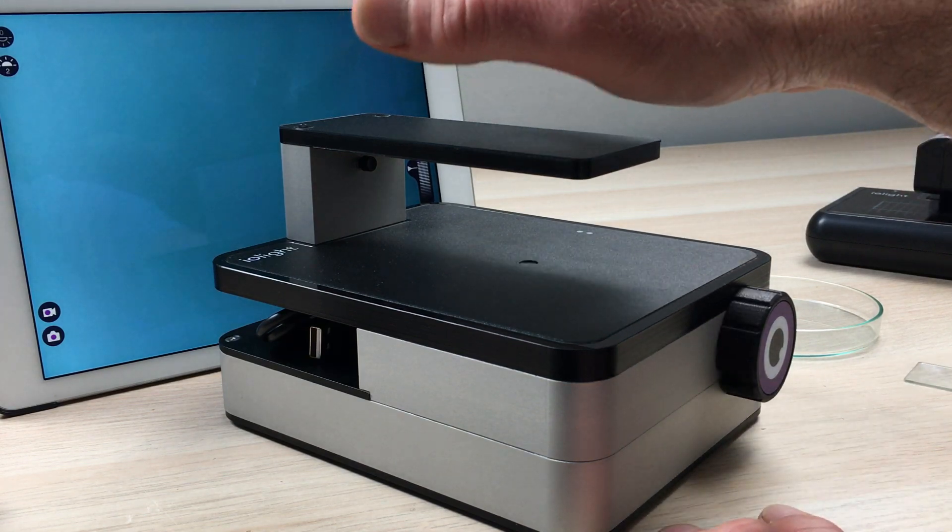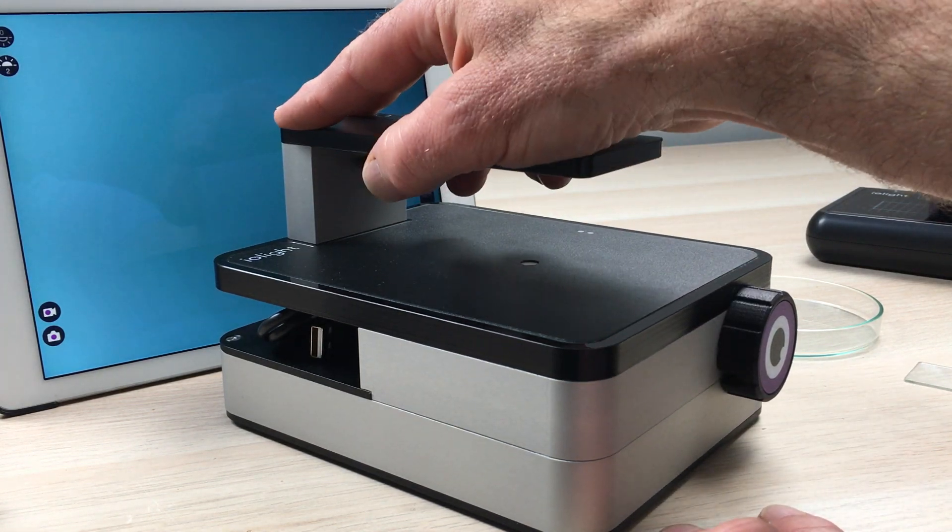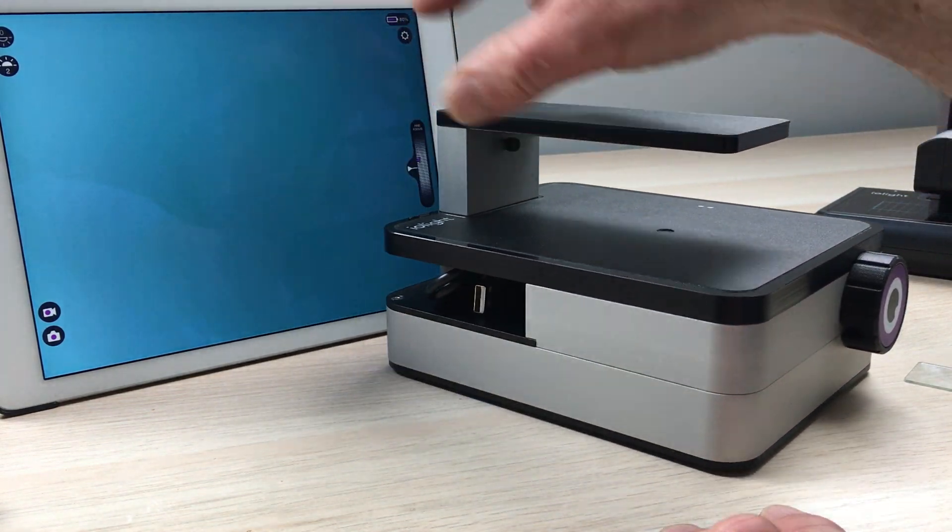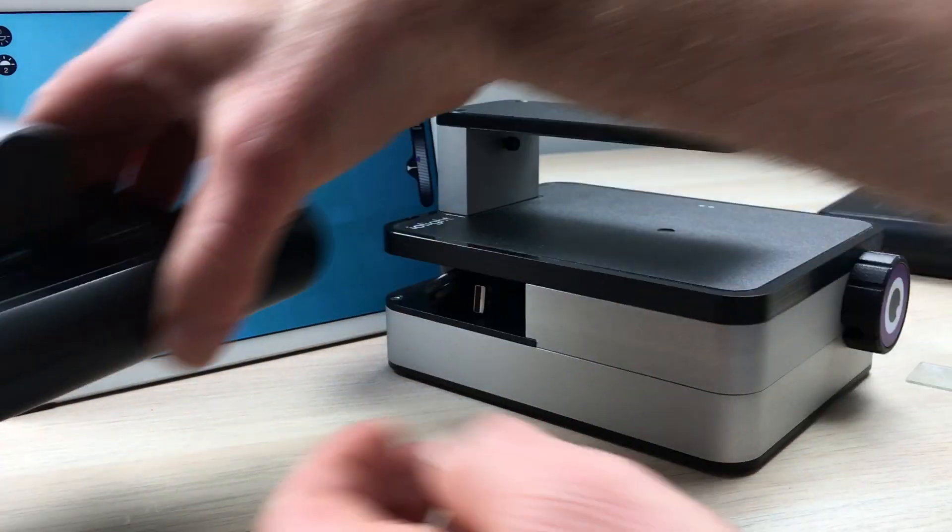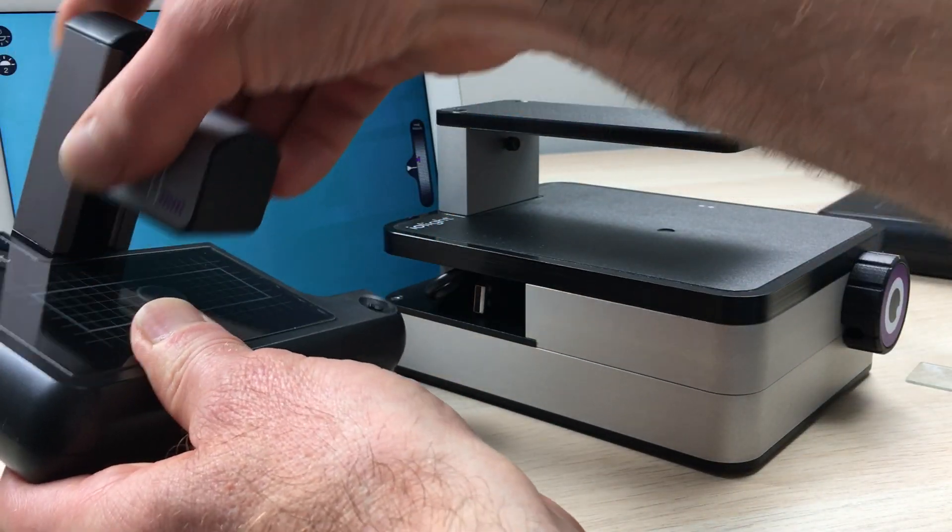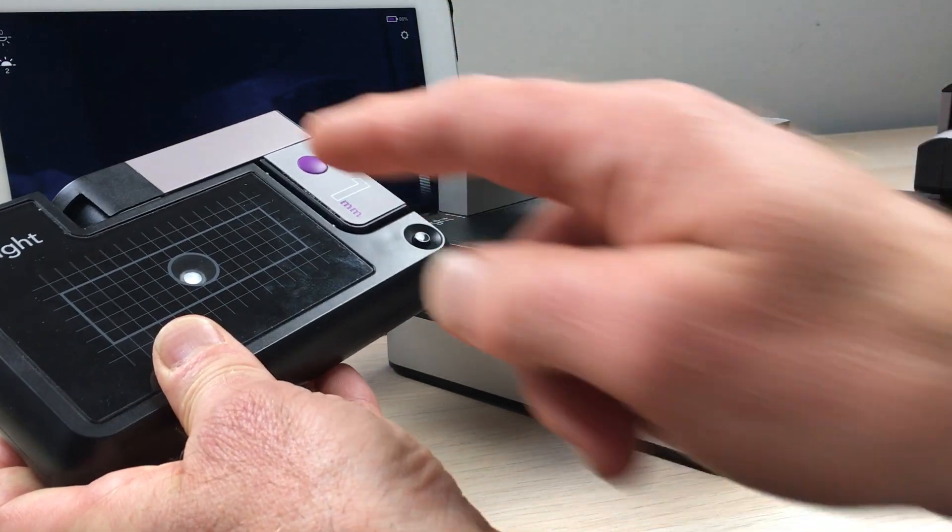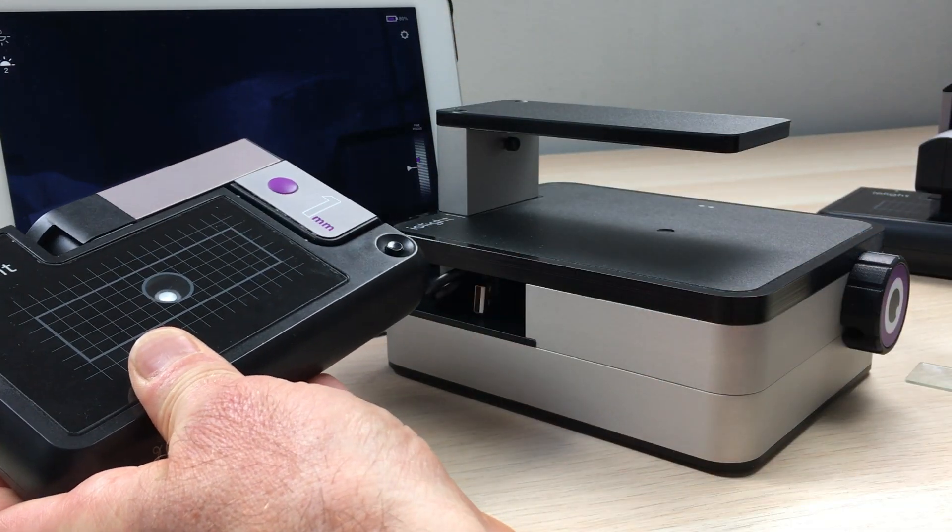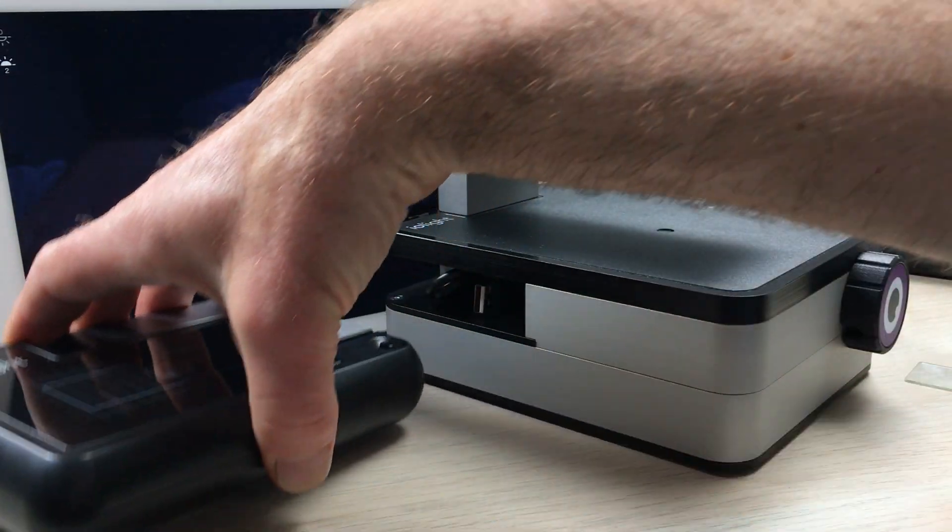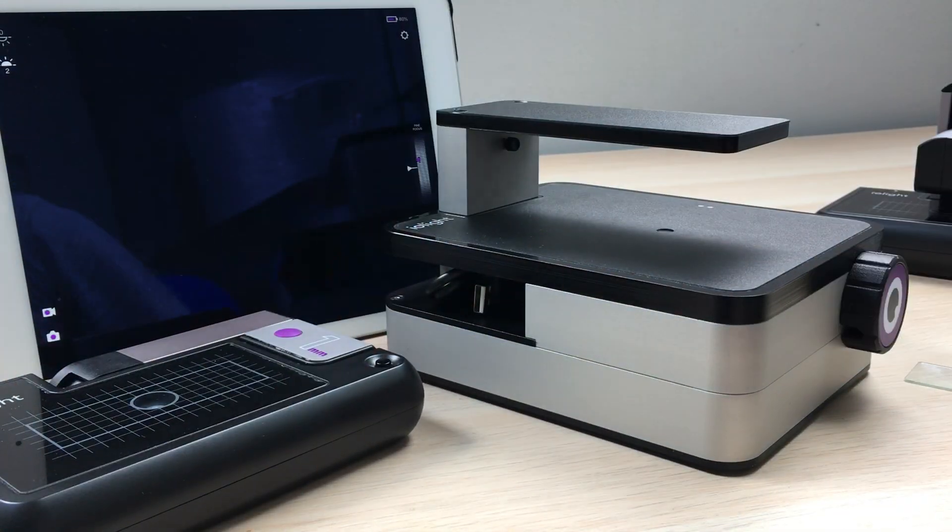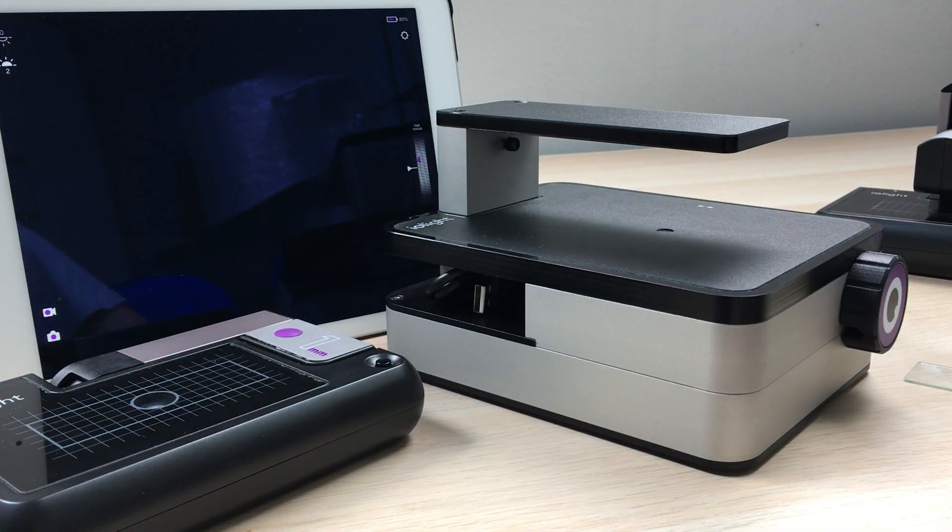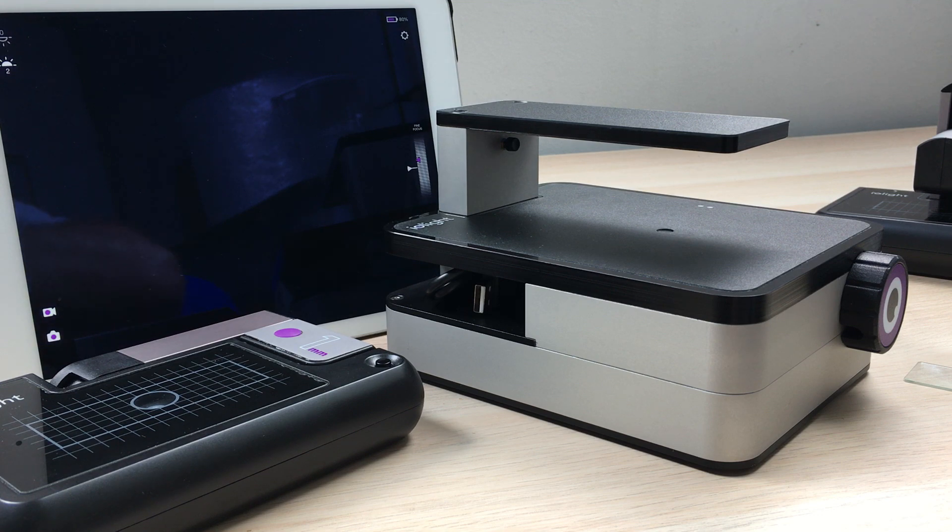So there we have it. We have our benchtop inverted microscope and a range of portable one micron resolution microscopes. Thanks very much for listening.